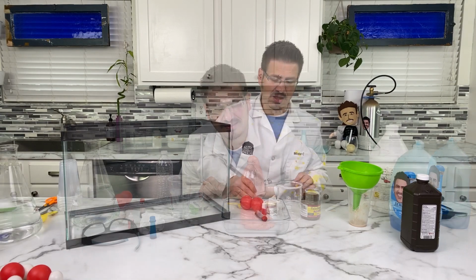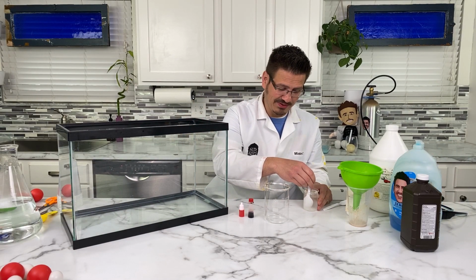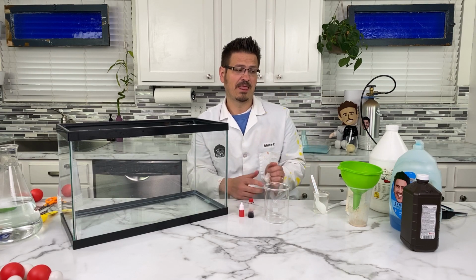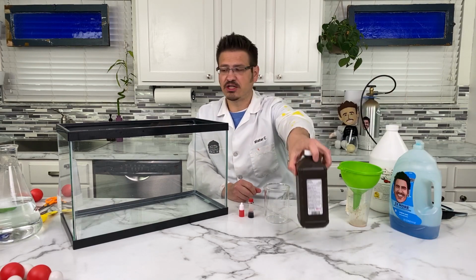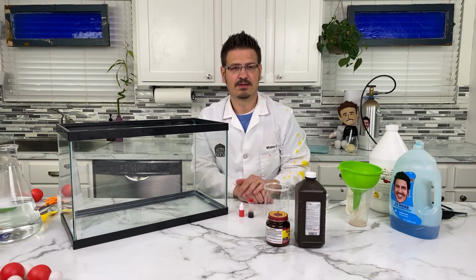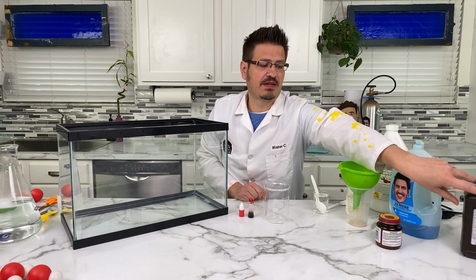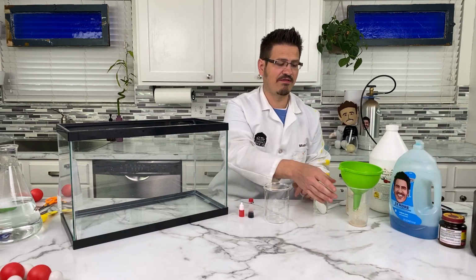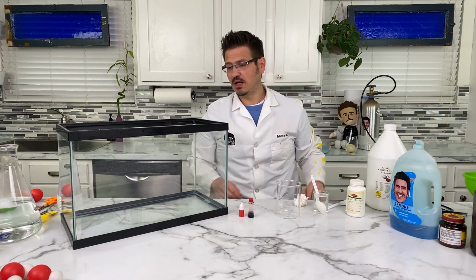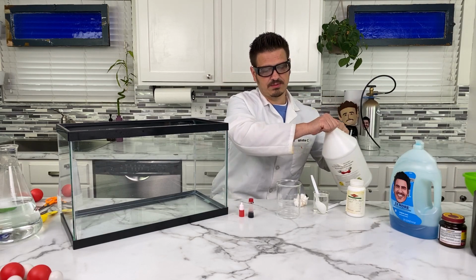Thoughts? Now, we are going to do one more experiment to wrap this up today. All right, here we go. So what I have here, in the experiment that you're doing at home, you used 3% hydrogen peroxide, yeast, soap, and water, right? For this experiment, we're going to do it a little bit differently. These chemicals are not chemicals that you have access to. This is a much higher concentration of hydrogen peroxide. So I'm going to throw on some goggles.